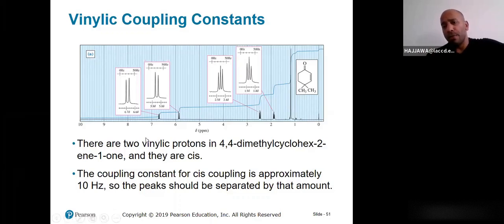Okay, the hydrogen that's on the carbon that's adjacent to a carbonyl will most likely be around 2.5 ppm, and the hydrogen that's farther apart will be around 2 ppm. And finally, the two methyl groups will be around 1 ppm, given that they are not surrounded by any deshielding effect. All right, so that's the location, and that's the number of peaks that I would expect.